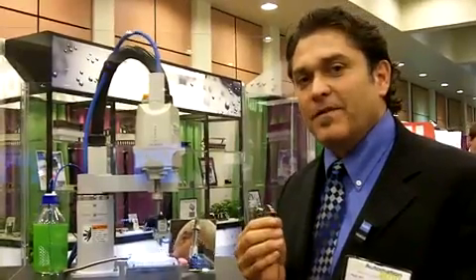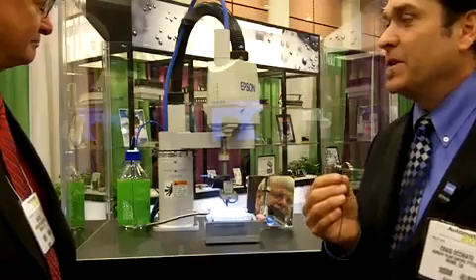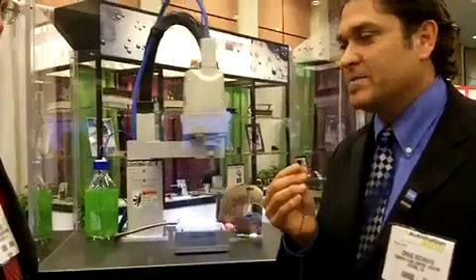Thanks, Tim. What we're showcasing at our booth this year is our Type 6650 solenoid valve. It's a unique flipper valve designed ideal for dosing. Our engineer designers for our solenoid valves have been making flipper valves for about 20 years, and what we've done is we've shrunk it down into a package that fits on 4.5mm spacing. It's ideal for microplates like you see on the robot here, or where you need a small valve.